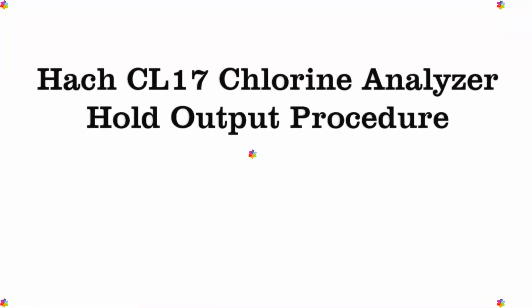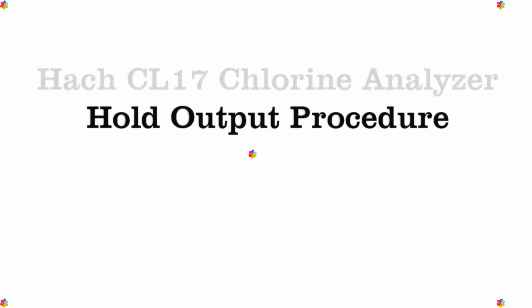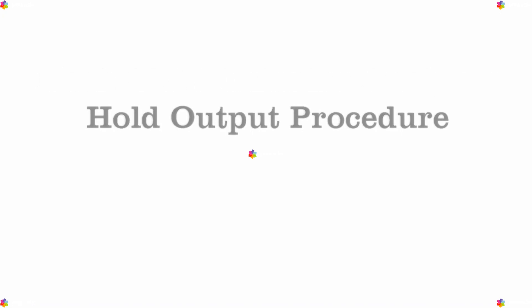This video will guide you through the steps for the hold output for the Hach CL17 Chlorine Analyzer. Let's get started.